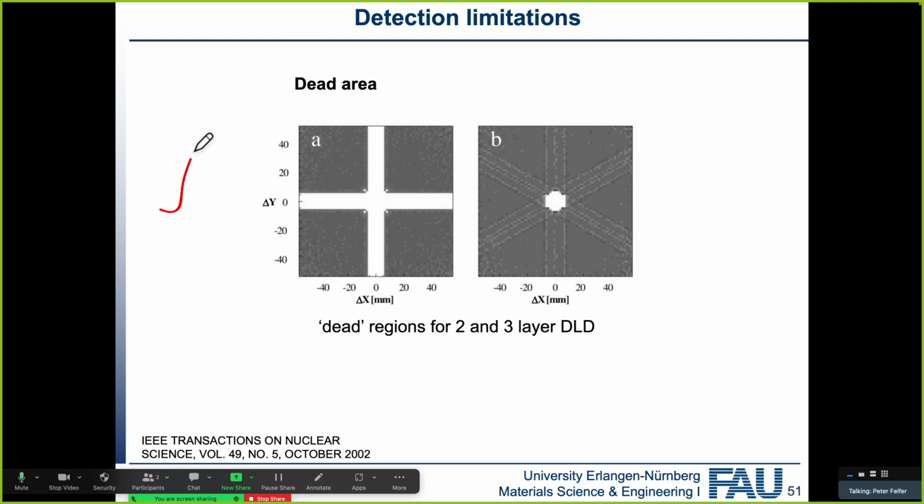So remember, we have this pulse of electrons. And just imagine you have two electrons hitting close to each other. And this is just double hit distance, so you can see if one hits here and the other one relative to it hits here, then it's fine. But if it hits here and here, then this coordinate we can't recover. And just simply because we will have 2 electron clouds that are close to each other, we can't really distinguish them.